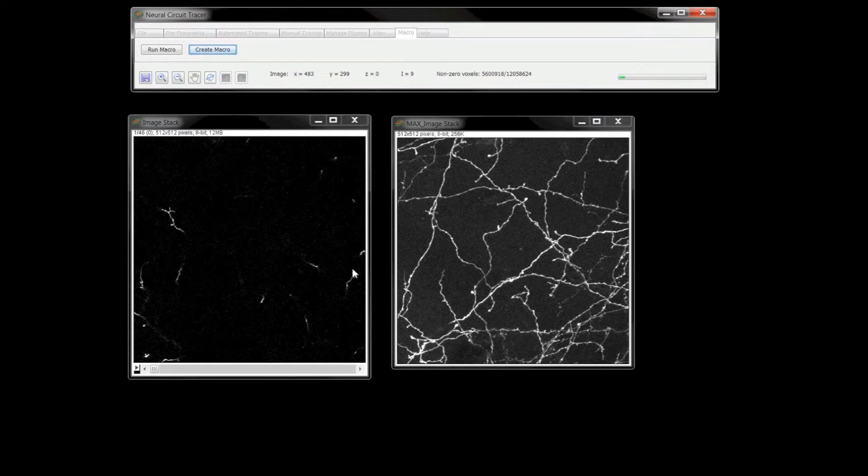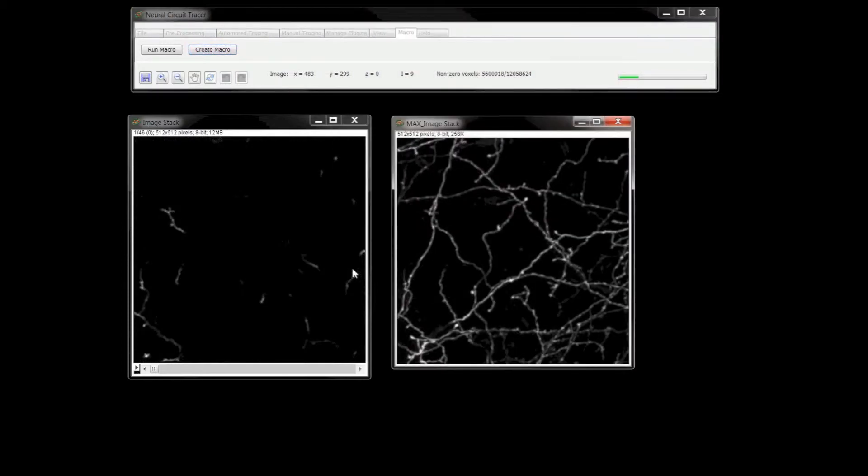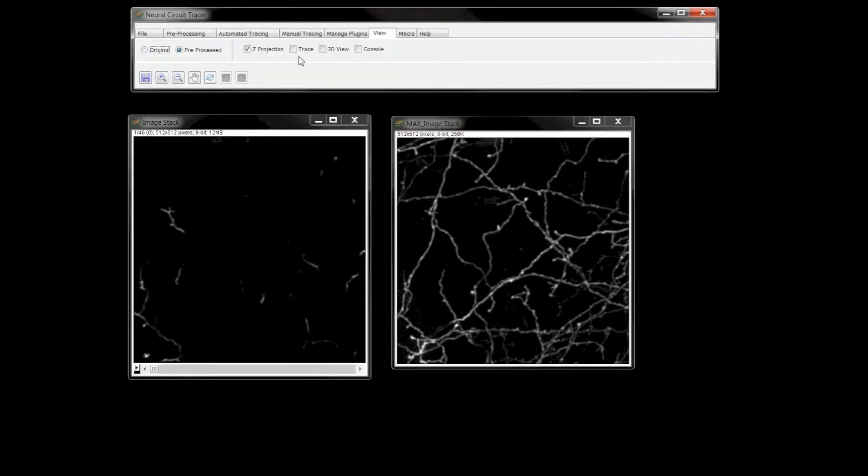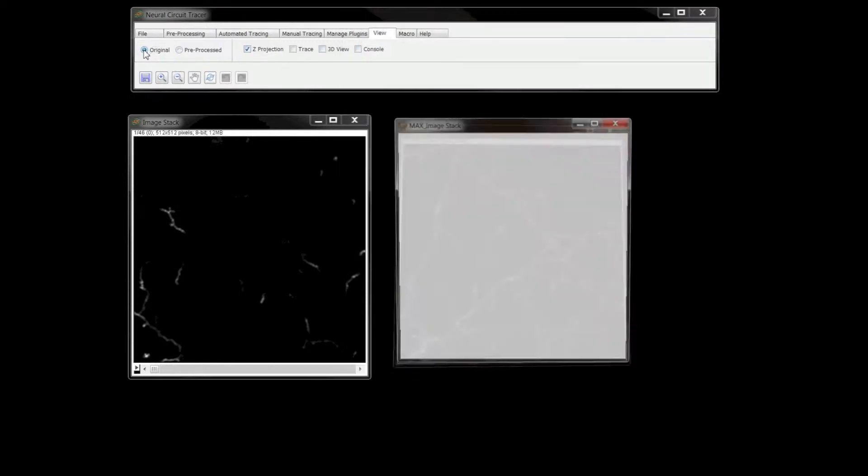I can now go to the View tab and toggle between the pre-processed and original views to compare the effects of the pre-processing algorithms on the stack.